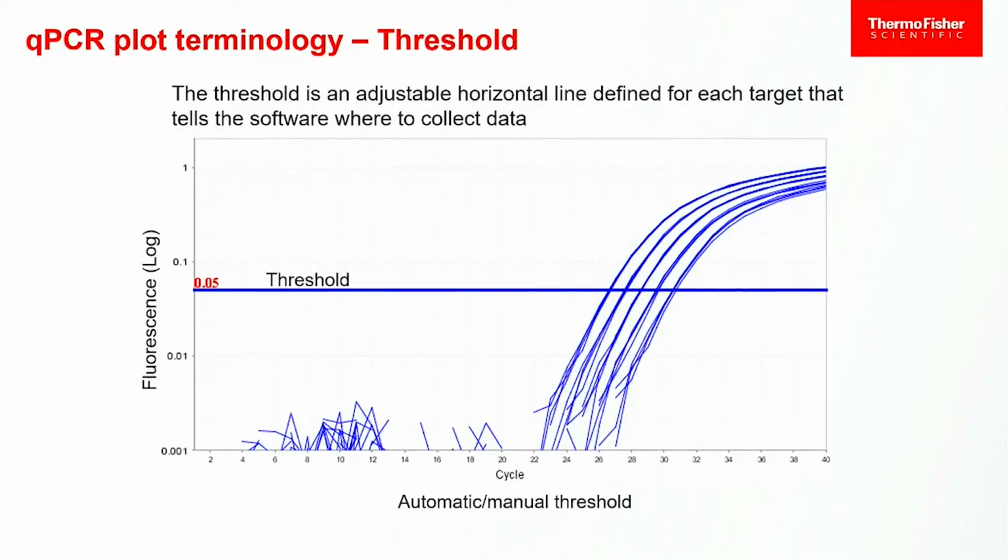So we have to really think about what we're doing and how we're talking about changes to make sure we're talking about them in the correct direction. When you're doing your data analysis, negative values, positive values, and sign changes can make a huge difference. Okay, so you do need to be careful. Excellent question, thank you.